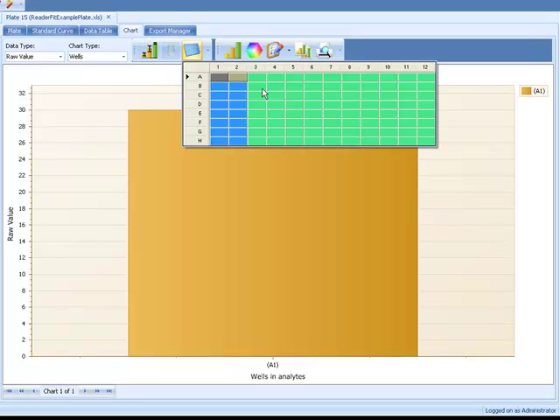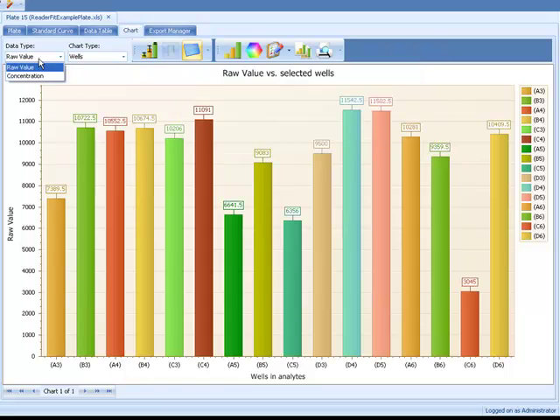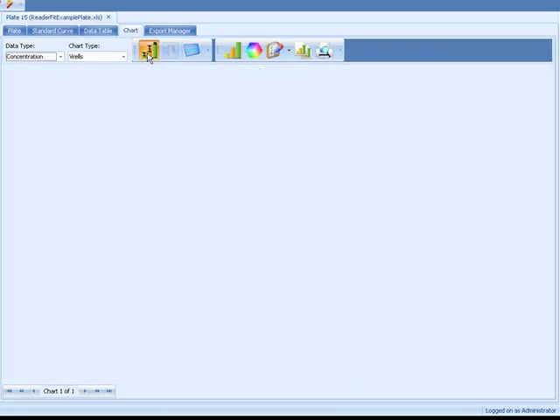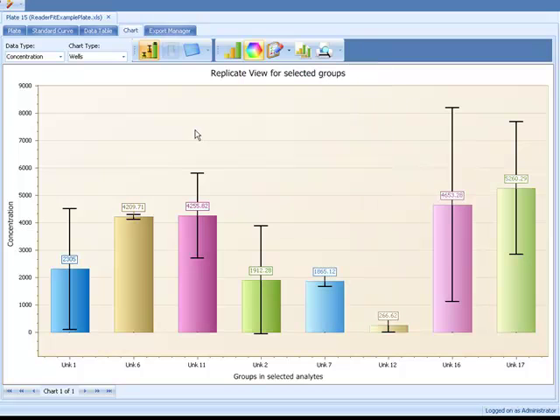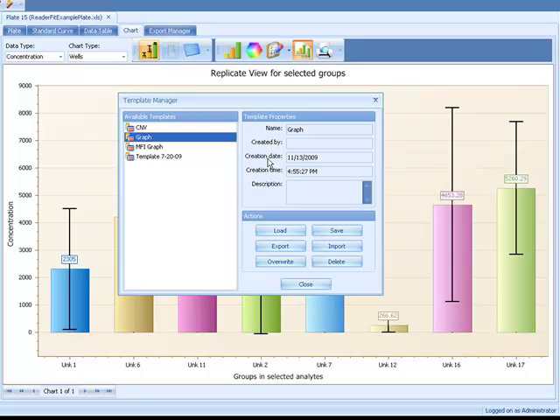Create publication quality graphs using the built-in graphing tools. Copy, print, or export the graphs to use in your reports or presentations. Save your formatting as a template for future use.